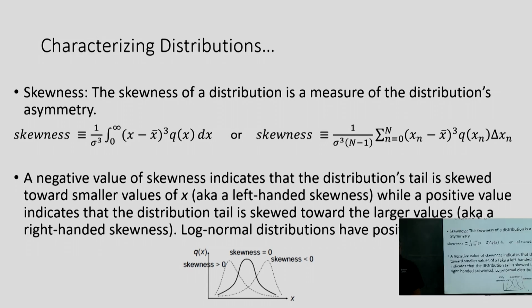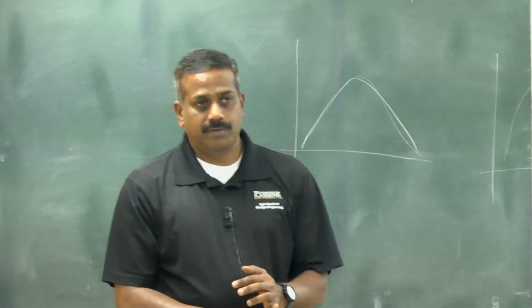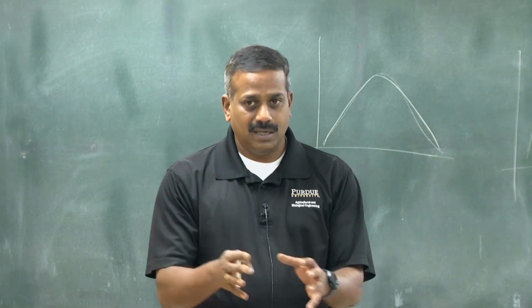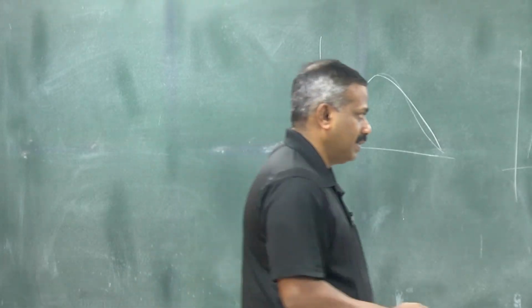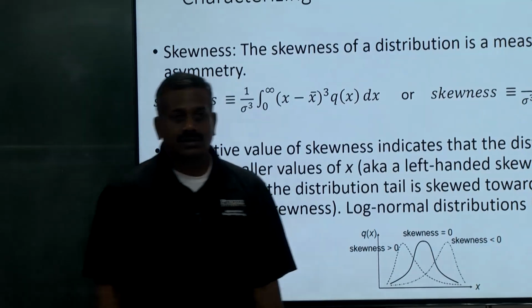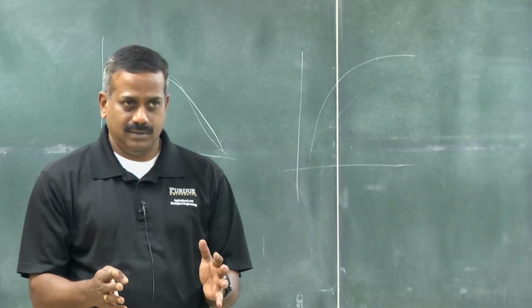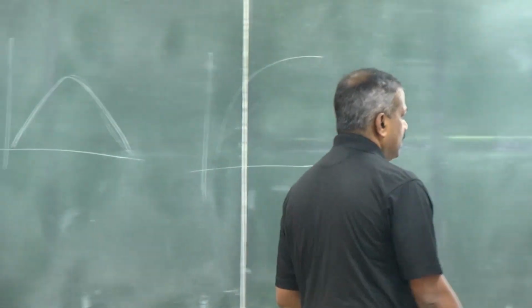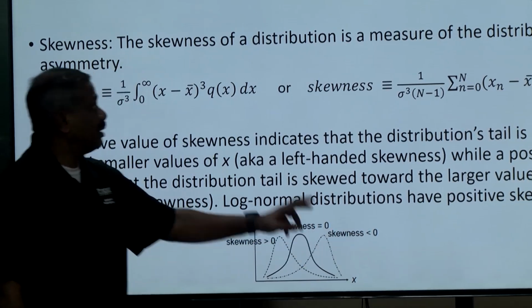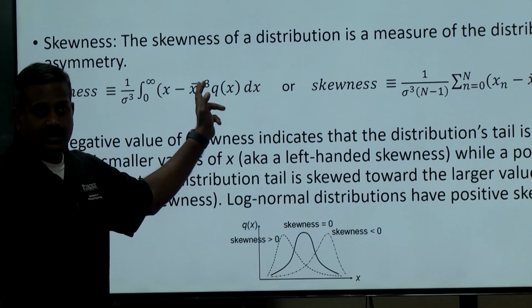Skewness is very commonly used. It gives more information about the type of particles, whether we have a smaller group of smaller particles or a larger group of smaller particles, etc. We calculate the skewness from the individual particle sizes and the average.